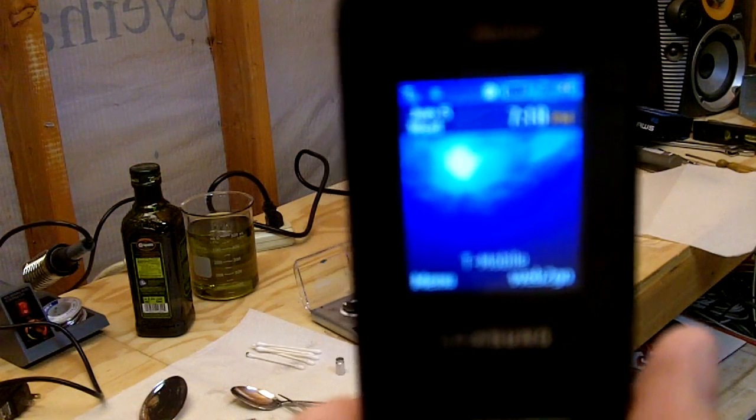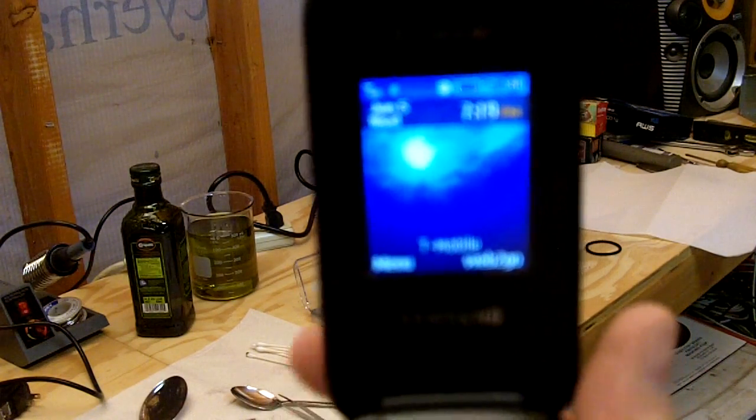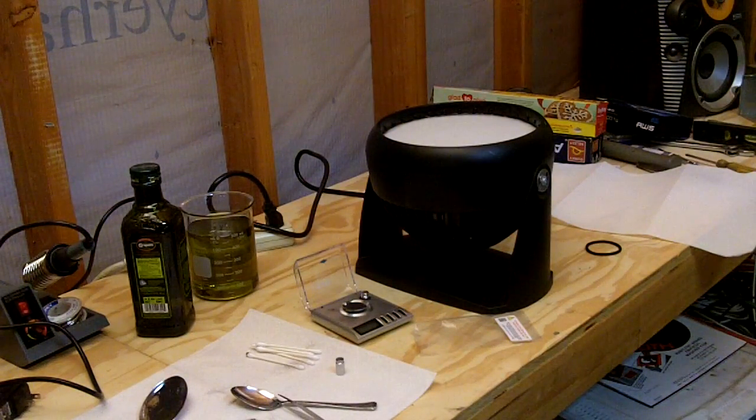It is June 5th, 2013, time is 7:18 PM. We are mixing C60 fullerenes into olive oil today on a homemade magnetic stirrer.